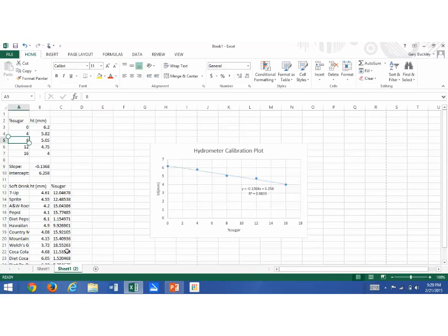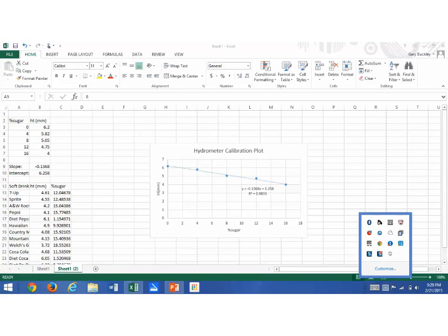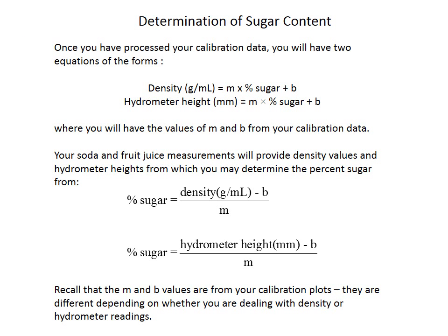I thought I'd just give you this rundown on Excel and how to use it. Certainly it'll be a little bit different if you're using 2010. You'll have things like layout tabs up here, but the right click for the trend line, all the formula writing, everything else is going to be pretty much the same. So I hope that helps. Hopefully that gives you some idea as to how Excel works.